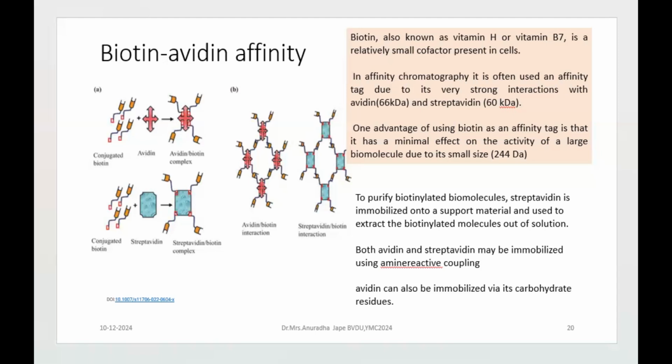It is just because of the structurally similar component that all the NAD dependent dehydrogenases have, right? So NAD is a common molecule having structural similarity among all those NAD dependent dehydrogenases.